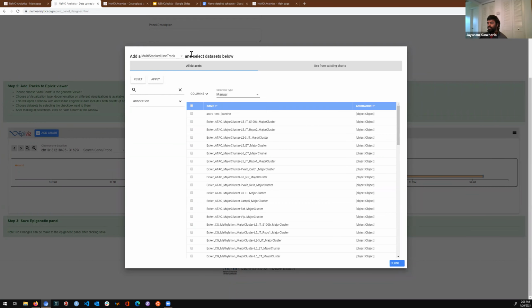So a few things here to walk you through this interface. There are a lot of visualizations that you can choose from, and our manual documents how these look and for what type of data sets you want to use. Quickly going through, the blocks tracks are the ones you would use for peaks, any files that you run through a pipeline that would call for peaks. Heat maps and scatter plots are usually for gene expression data or matrix-like data sets, and the rest of them for signal or coverage files.